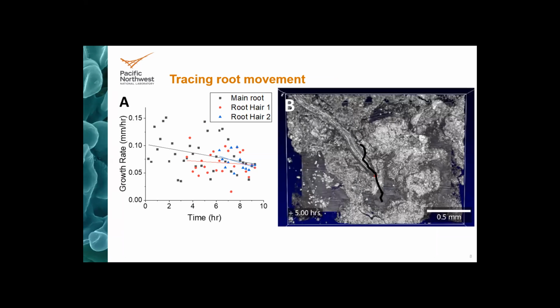Sorry, like, Curtis? Yeah. Is it how many days or hours of imaging? That series was over about 9 hours with taking images every 15 minutes. But we've definitely done imaging series that go over much longer.